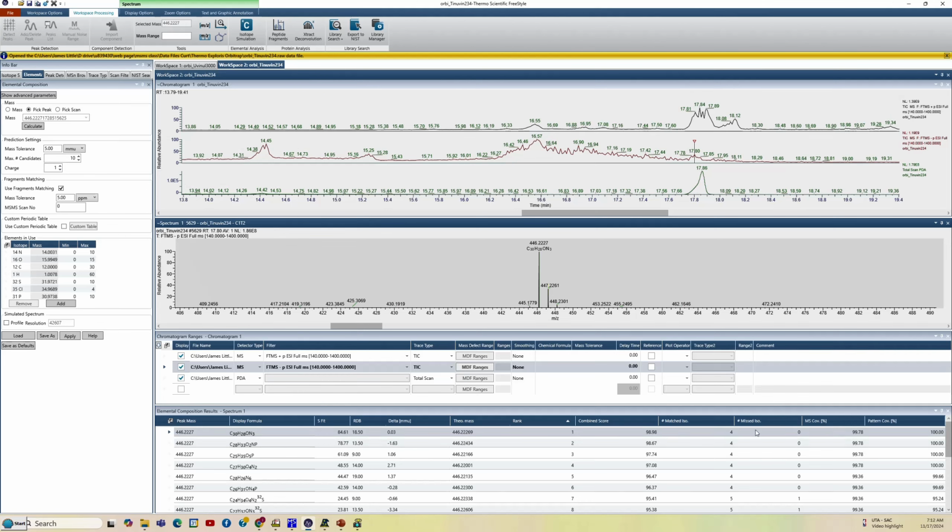Didn't miss any. So again, we use both of these pieces of data to indicate that 447 is the molecular weight, and the molecular formula is determined. And then we can carry that information to the MSMS search and use those limiting values and the associated data we get from that and model compounds from there to propose the structure.